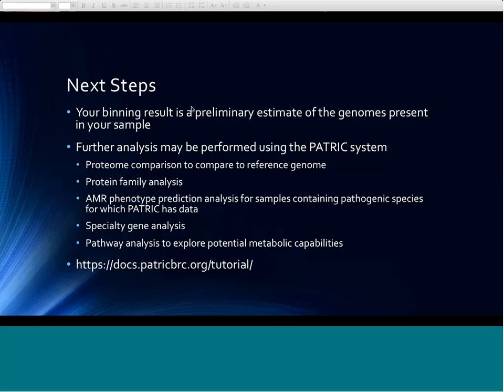We have an ID mapping service that allows that. You can do it, I think, also from the feature page. You can map to other IDs, and then there's also an ID mapping tool. It wasn't really in the scope of this, but we could point this person to that little tutorial.